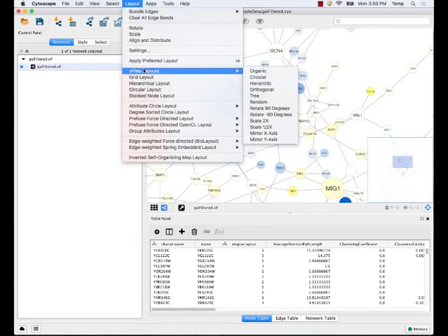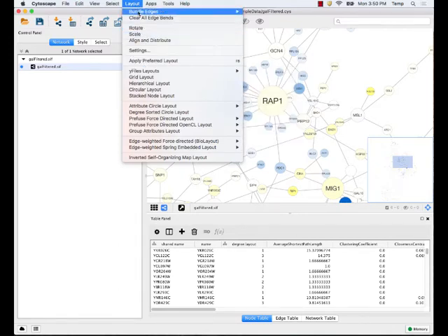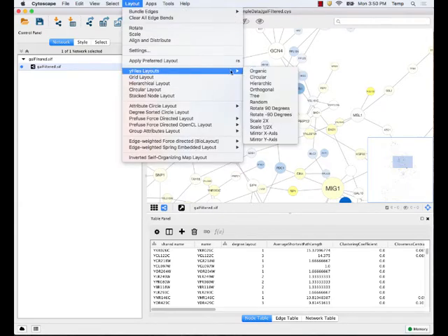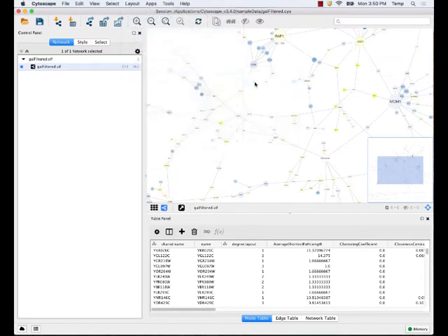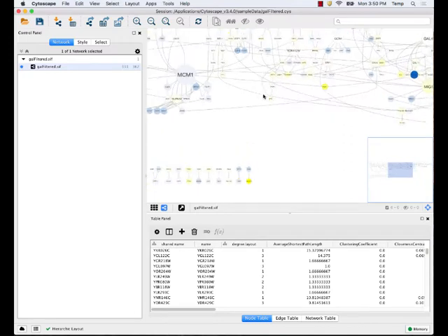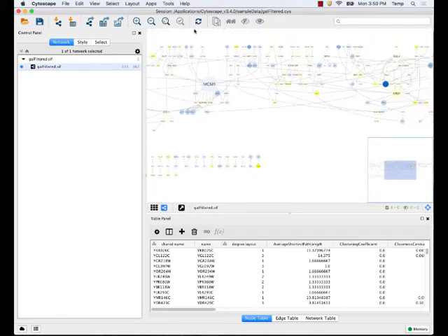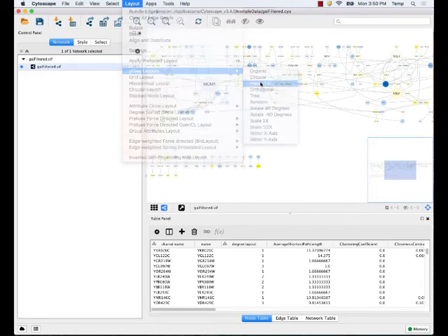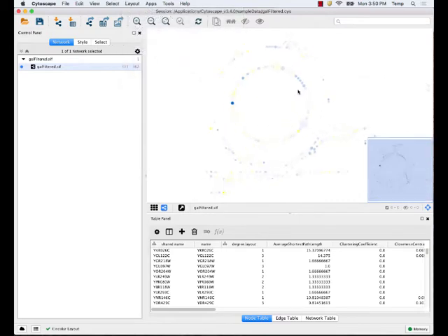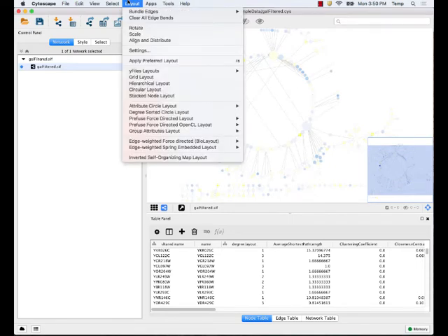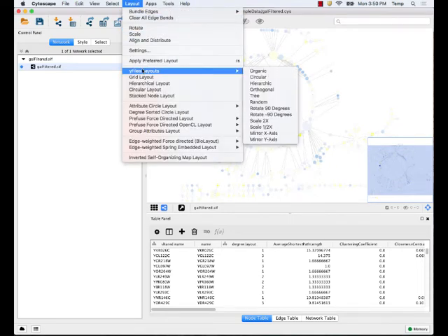Once you get a network into Cytoscape, one of the first things you might do is lay the network out. In the Layout menu there are a number of layouts — like Y-files organic. If you click on these you'll get different layouts. Here's a hierarchical version, which tries to lay it out in a hierarchy. Here's a circular layout, which tries to identify cycles. I recommend trying a bunch of them out just to see what's available.